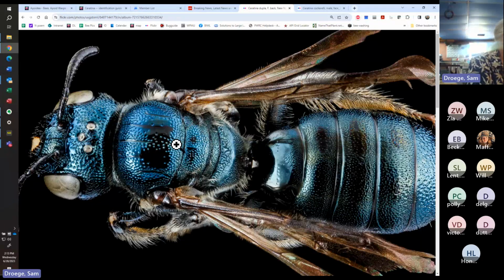All right. And now I'm going to be curious. All the species I've looked at so far have them. Now I'm going to be curious as to whether they show up in other species groups besides Ceratina. I mean, we look in Apidae, right? Because this is an Apidae thing. And theoretically, Xylocopa are close kin. Yeah, they all seem to be kind of doing the same thing. I'm going through all the specimens.